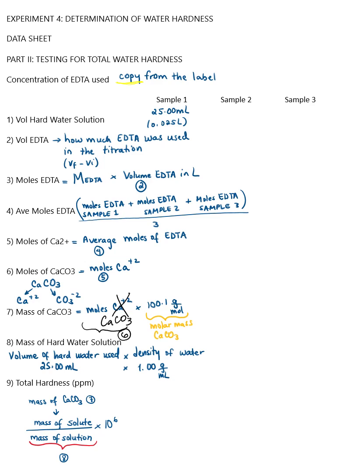Mass of hard water. So you want the mass of your total solution. So you have the volume for your sample, it's 25 milliliters. Okay? So you can convert a volume to a mass, or whatever number you have in units of volume, to a new number with units of mass using the density as a conversion factor.